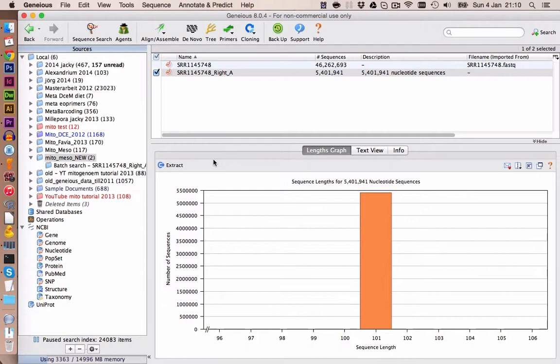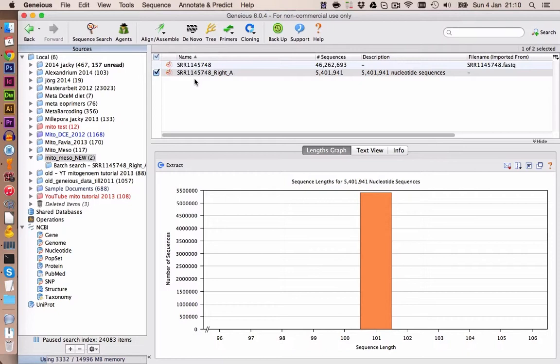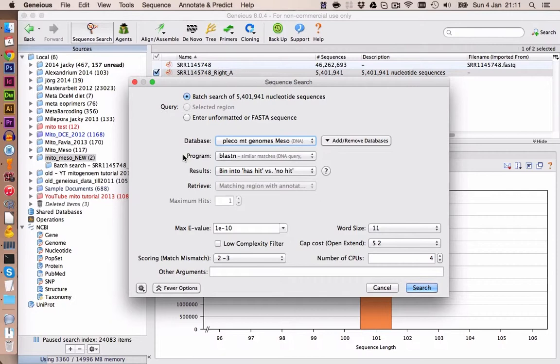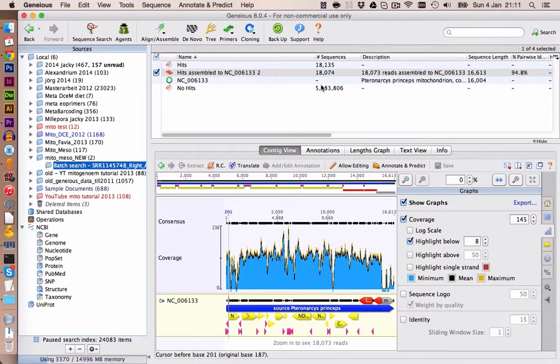It turns out that extracting all 46 million sequences is a bit much for Geneious. Even with 5.4 million it's still difficult because I only have 16 gigabytes of RAM. However, I extracted 5 million sequences and ran a BLAST search against the complete database containing mitochondrial Plecoptera reads and also the Mesocapnia sequences. Here you can see the settings I used. This will take quite a while. Next I will show you the results of this BLAST search.